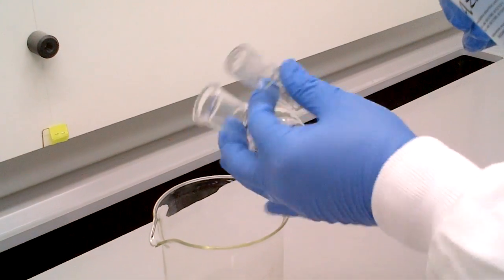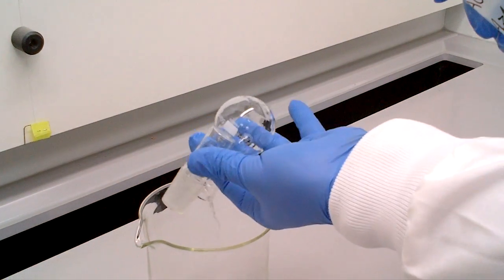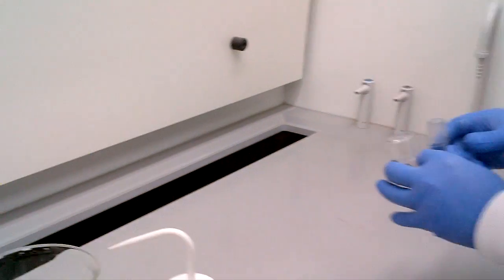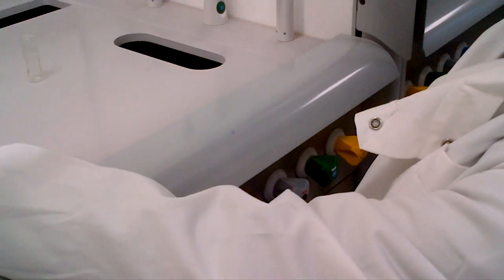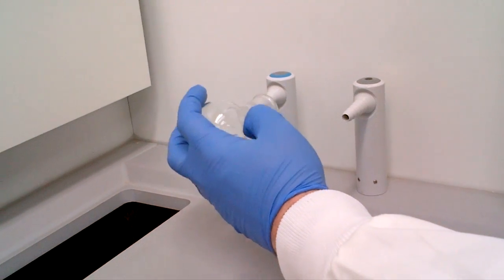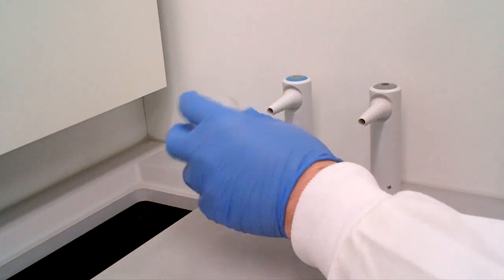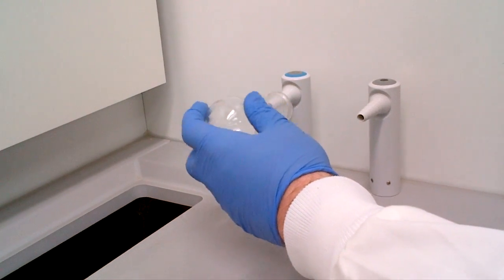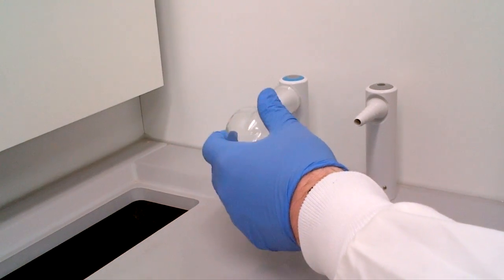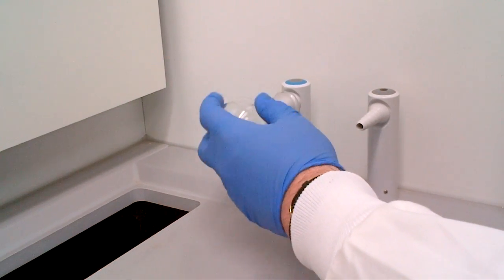Make sure all points of the flask internally are washed with acetone. We're doing this about 4, maybe 5 times. Notice each squirt I only had about 2-3 ml of acetone. Back towards the fume cupboard or towards an appropriate bench. Again, compressed air or argon or whatever it could be. Rinse around, empty. And again, this will take about a minute. So if you're doing 3-4 minutes of this, you should worry you're doing too much. So give it a rotate around, rotate around.